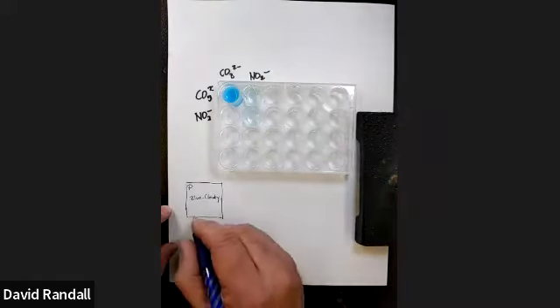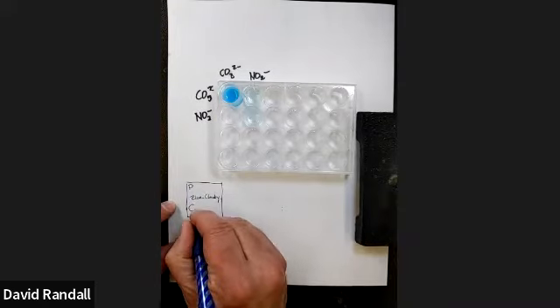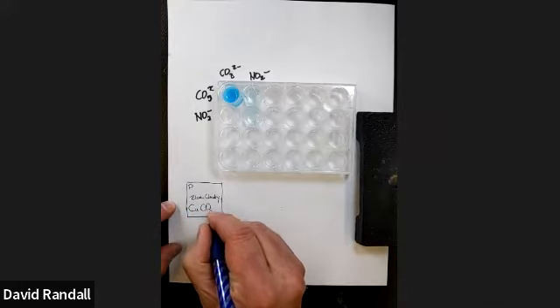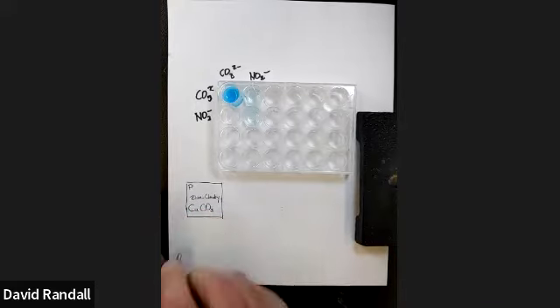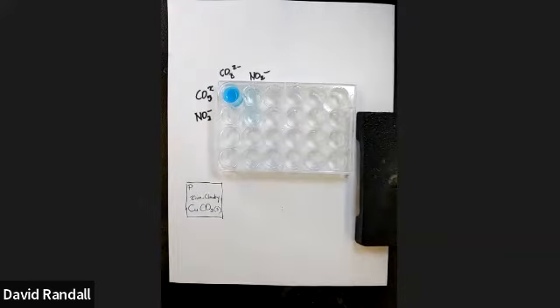And then we need to make a chemical formula. Because it is a precipitate, it will be neutral. So it will be copper 2 plus and carbonate 2 minus. That makes a 1-to-1 species, and that's what it is. Let's emphasize that it's a solid by writing S there. So that's what happens when we mix copper and carbonate. That's useful for comparing later.